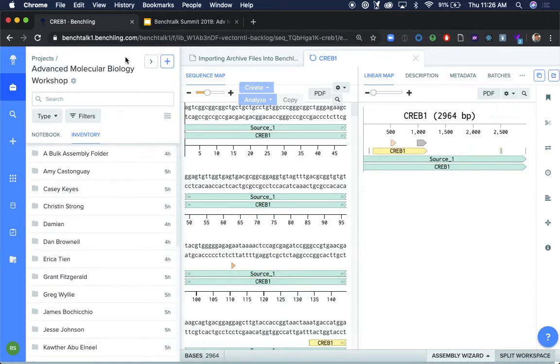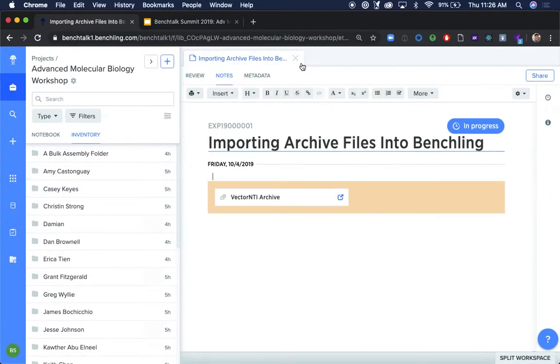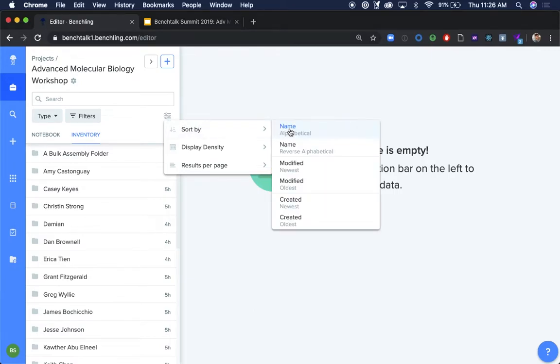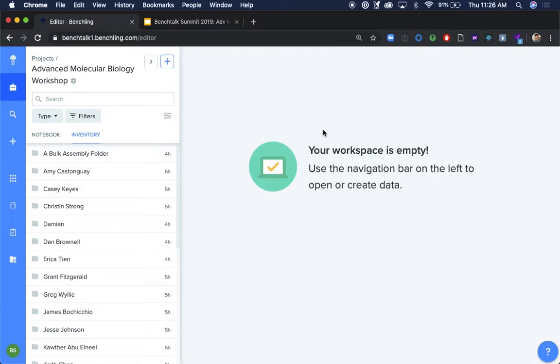So for this next part, you guys who have folders here, please feel free to follow along. One thing that I do suggest is that you'll notice there is this display icon here. When I click on this, it gives me these display options. I highly recommend sorting the folders that we have here in alphabetical order. This will make the user flow a little bit more friendly as we continue on, and it also calls out that you can organize folders and sequences in a fashion that makes sense to you. So I do recommend putting these in alphabetical order if you haven't already.